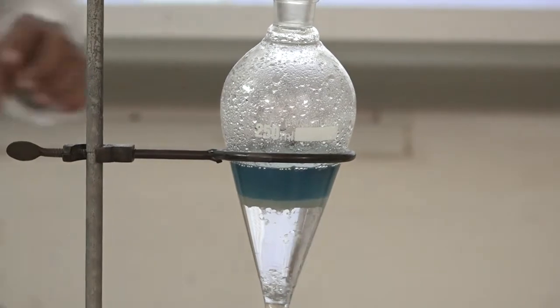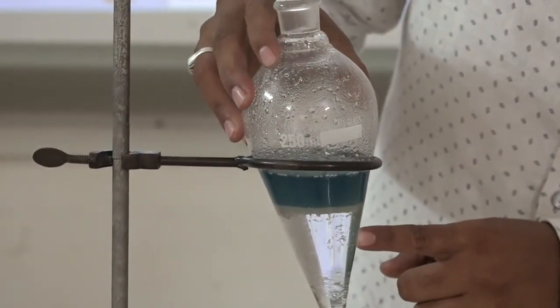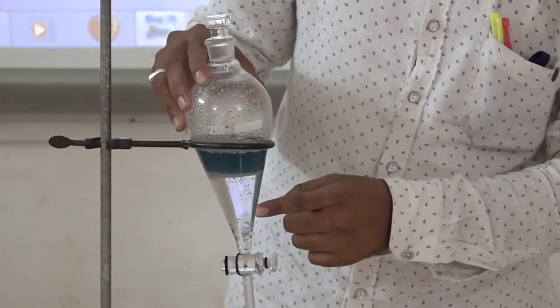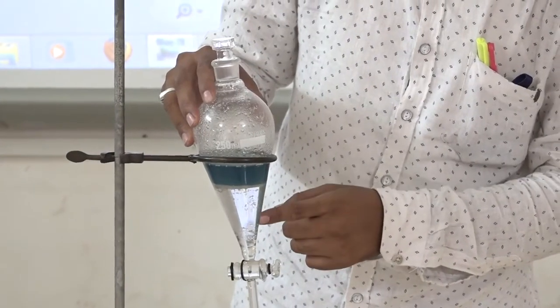Are you able to see the two layers? The bottom layer is the water layer. So we can say that water has more density than kerosene. Due to this reason, the kerosene floats on the water.